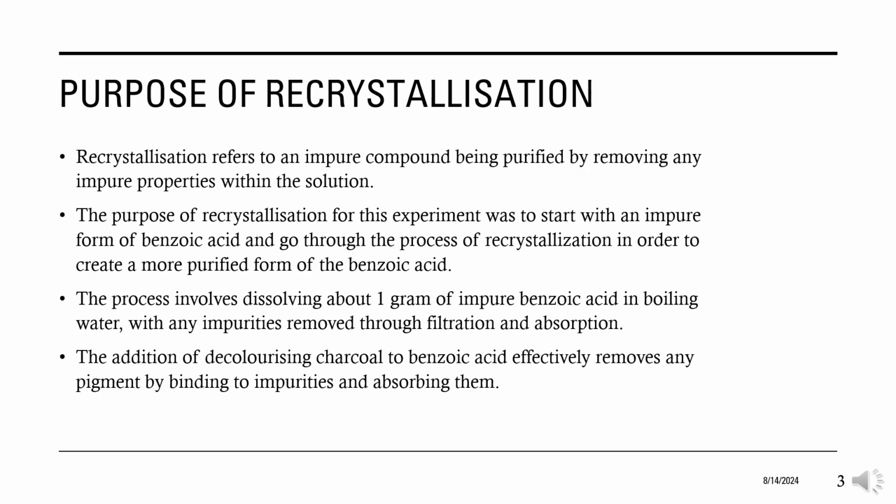Purpose of recrystallization. Recrystallization refers to an impure compound being purified by removing any impure properties within the solution. The purpose of recrystallization for this experiment was to start with an impure form of benzoic acid and go through the process of recrystallization in order to create a more purified form of the benzoic acid.